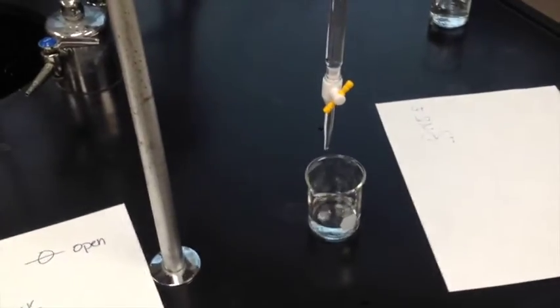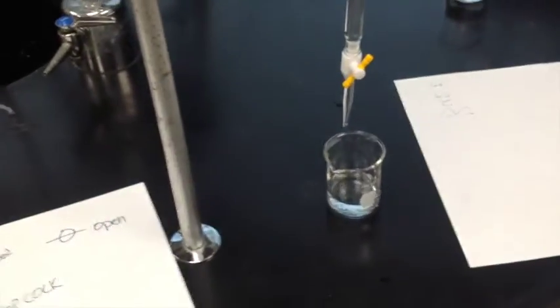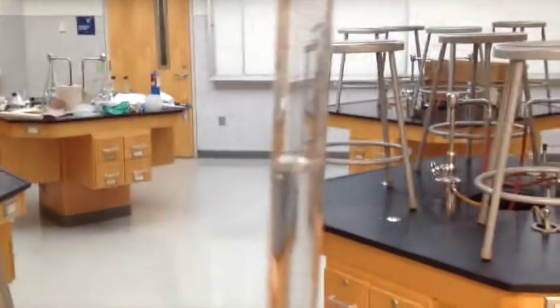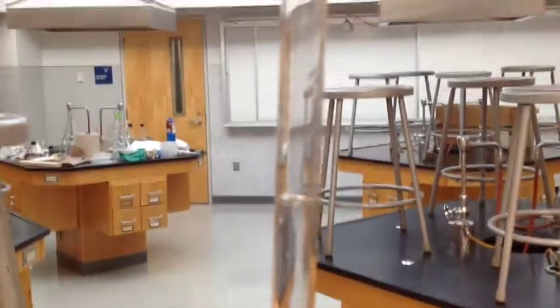And something will happen eventually. That's something we'll have to talk about and then come back and see. But now we're adding a very, very steady stream of whatever's in our burette to the reaction vessel. So we try to refocus this here. It's surprisingly difficult to do this with one hand. And you can see, even though it's dripping, that water level is falling about 1/10 of a milliliter per drop, give or take.